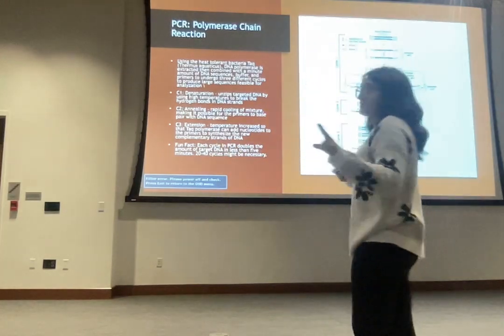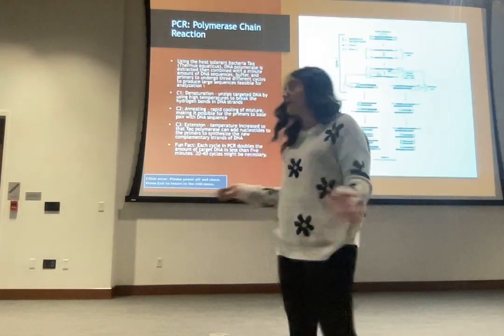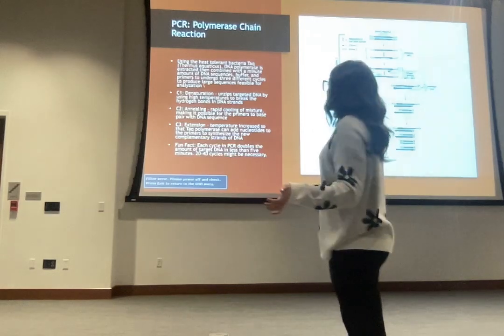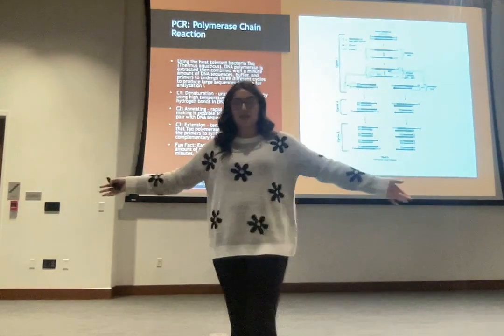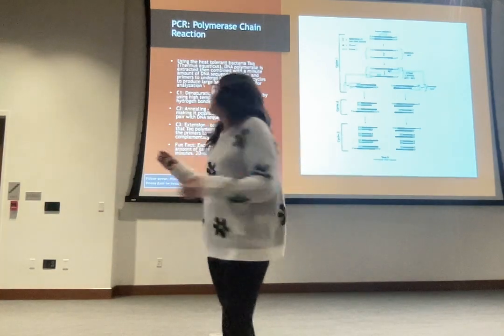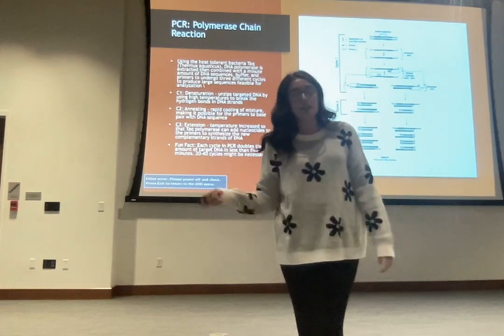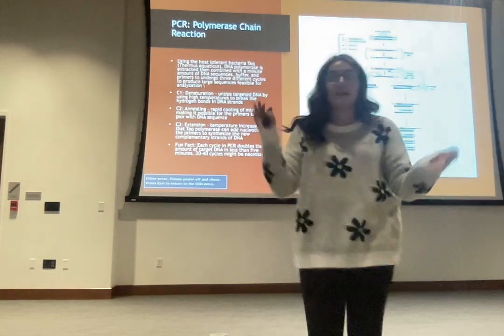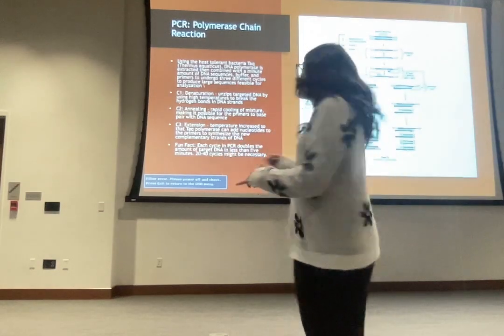And then we're going to combine those DNA sequences with a buffer. I believe we are going to be using lysis buffer and primers to undergo 3 different cycles to produce bigger sequences that makes it easy for us to analyze. So the first cycle is called denaturation, and that happens by using high temperatures to denature the proteins, which breaks the hydrogen bonds in DNA to break up the DNA sequences.